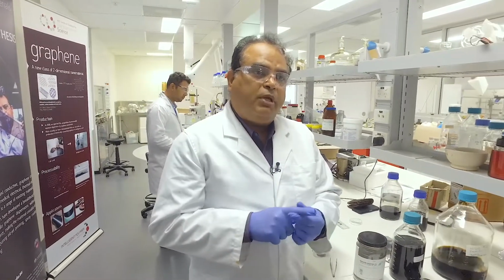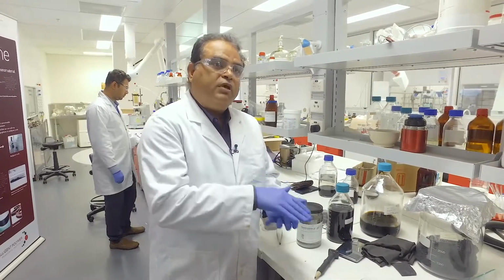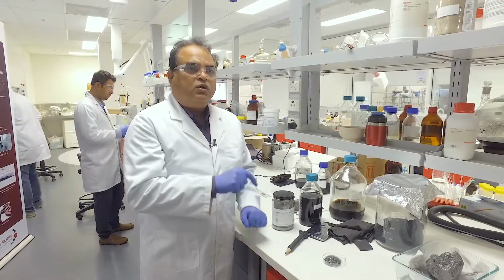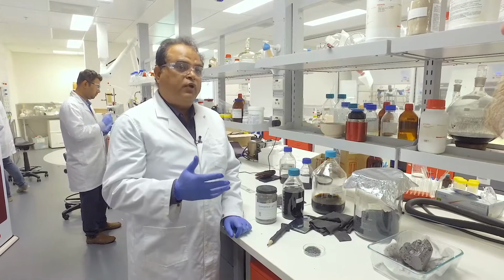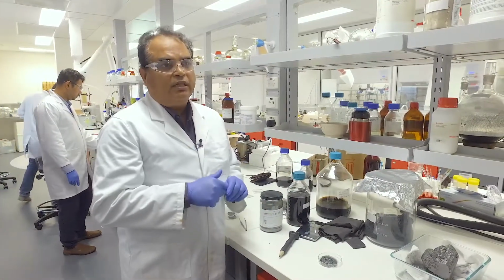And that intercalation involves putting other ions between the sheets of graphene in these flakes. These intercalants need to be of very high boiling nature, because they need to stay within the pi space of the graphite. So we have optimized orthophosphoric acid, nitric acid, and sulfuric acids, which are the main intercalants we have been using for intercalating the graphite.